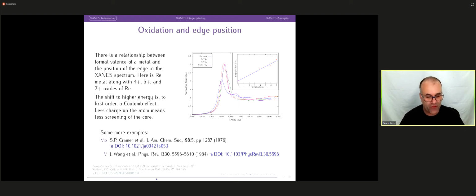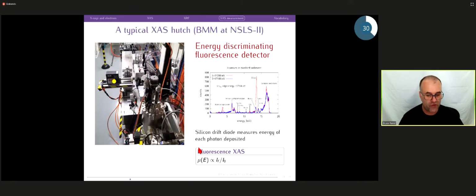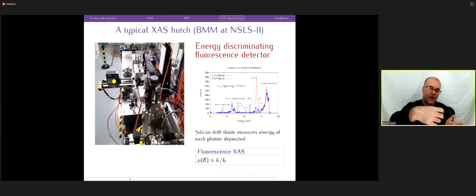Last question is about the escape peaks and the Compton peaks in the spectra. So this person is asking about these peaks and these peaks over here. So the escape peaks are this. The photons that are coming into the detector will generate current that can be measured as what they are. But the thing is those photons coming into the detector, if they're high enough energy, those photons can excite the germanium atoms that are in the detector or the silicon atoms that are in the detector.